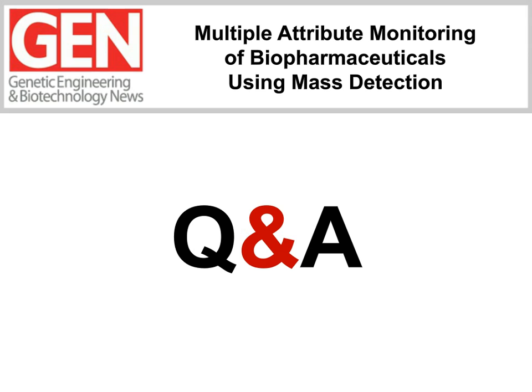So to clarify that discussion, the point is not that the QDA could replace something like a higher-end MS or QTOF or a G2 instrument. Those higher-end instruments are still very necessary in order to do the characterization to identify what the specific species of interest, whether they be peptides or glycans, are, to really understand and characterize what all the structures within the sample are.